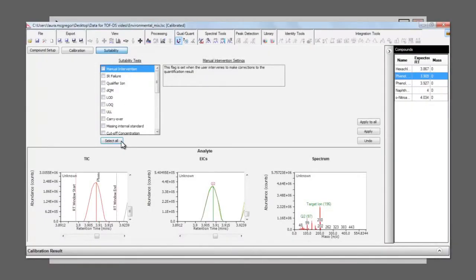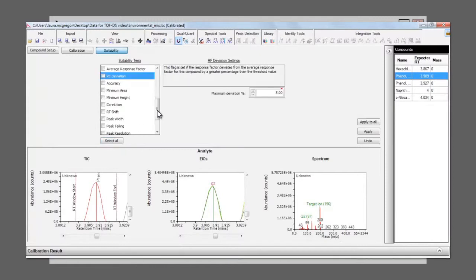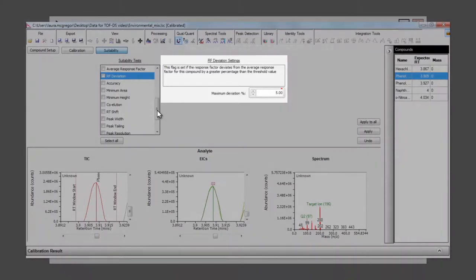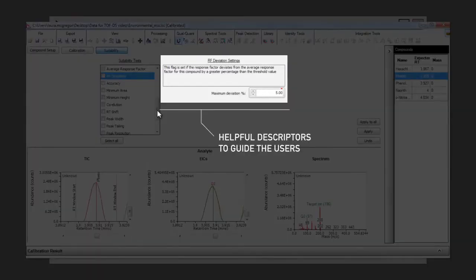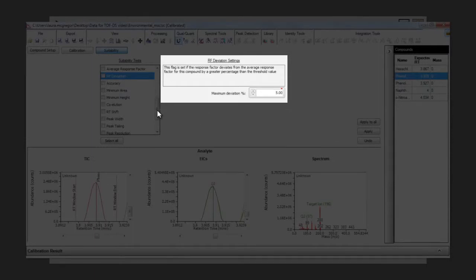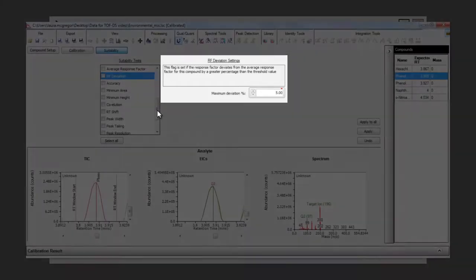If these settings or threshold values aren't met during the quantitation process, the samples or compounds that have failed are flagged up with a red cross, enabling you to see at a glance if there have been any problems. A brief description is shown for each parameter, making it easier to decide on the threshold value that should be used.